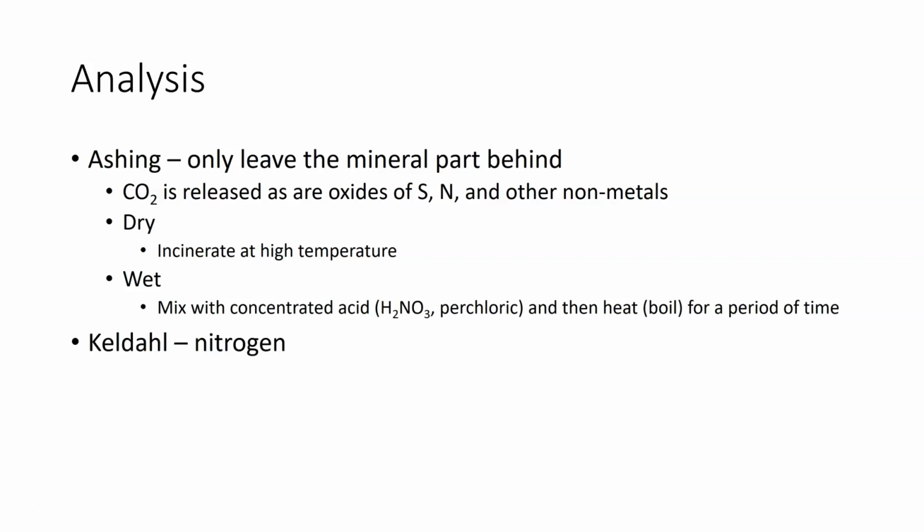We have what we call a Kjeldahl method, which is done with nitrogen, and we'll explain that later. This has a reagent added to it that's going to trap the nitrogen that is released. We can sample the nitrogen. We can sample it in a couple of different forms.